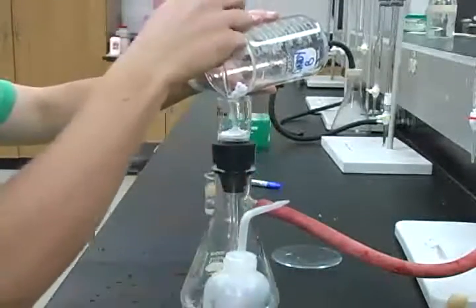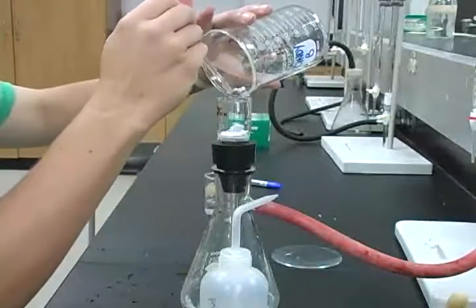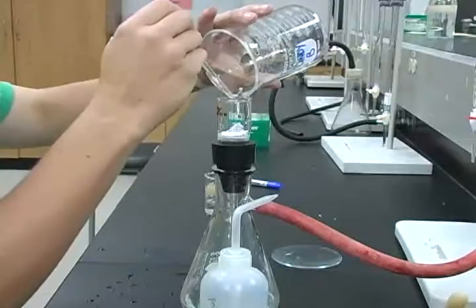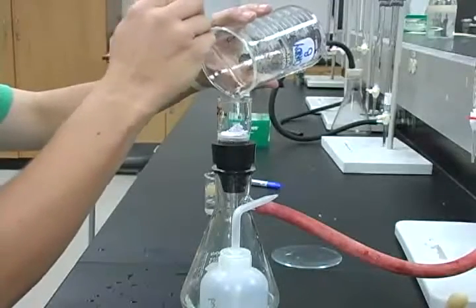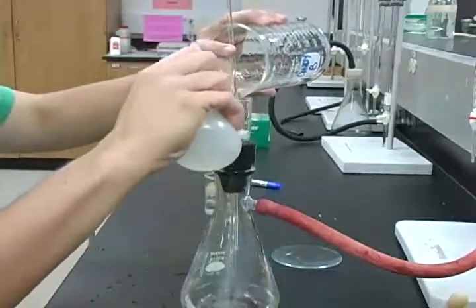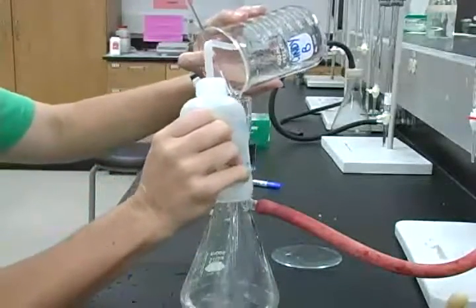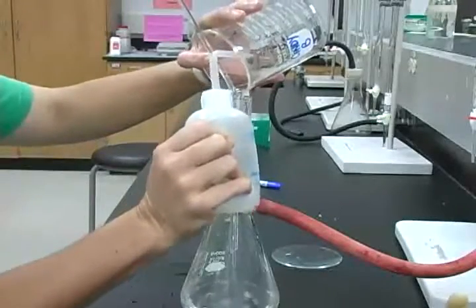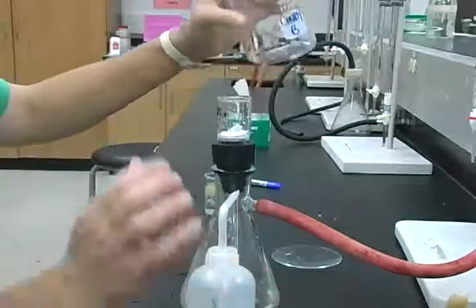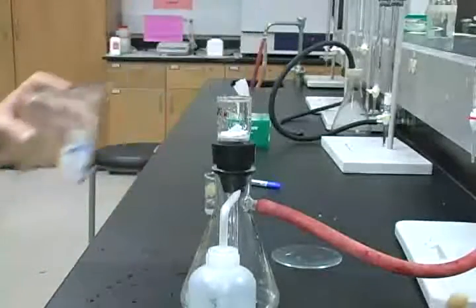For stubborn solids that won't dislodge, you can use your stirring rod to direct those into the crucible. And just be sure to rinse the solids that are on the stirring rod back into your crucible. You want to continue this process until every trace of solid that's in the beaker is removed and in the crucible.